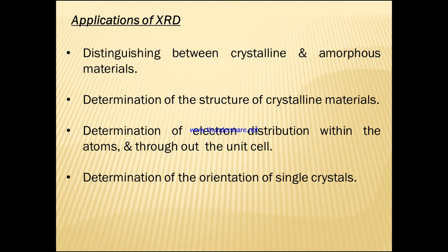Minimal sample preparation is required for this. The data interpretation is very simple and straightforward. So we get the results or the analysis with respect to the XRD technique very easily. So we should know that the XRD technique is very useful for the analysis of crystalline material.